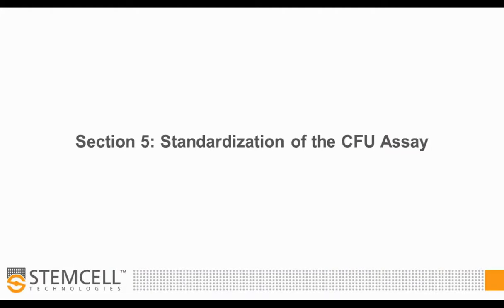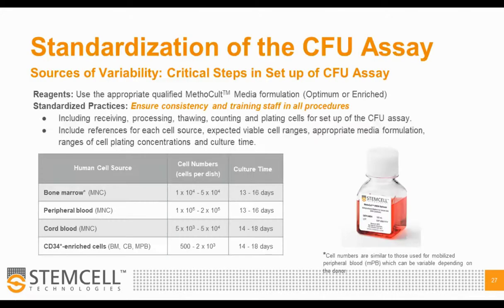So just before we close off then, I just wanted to give you some tips and tricks about the standardization of the CFU assay. As we recognize from this presentation, it's definitely a very versatile assay, can give you a lot of information. It hasn't been used more widely because of the sources of variability in setting up this assay.